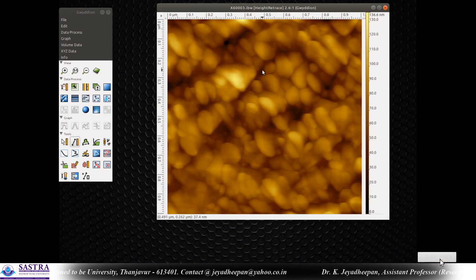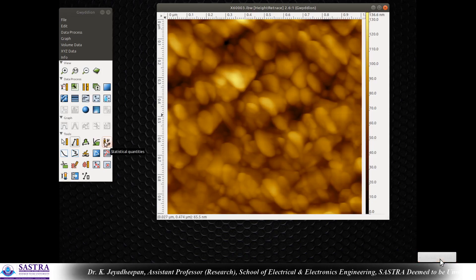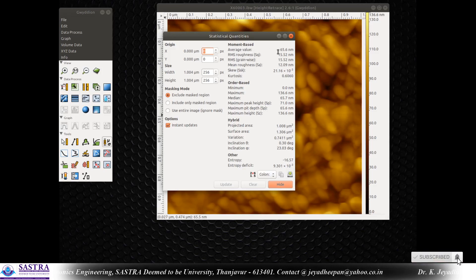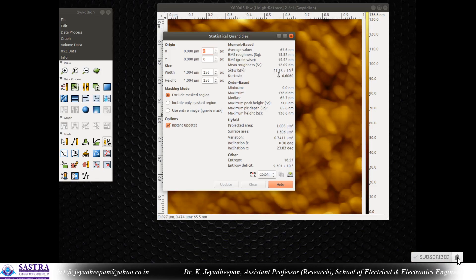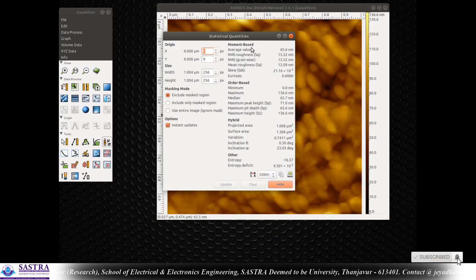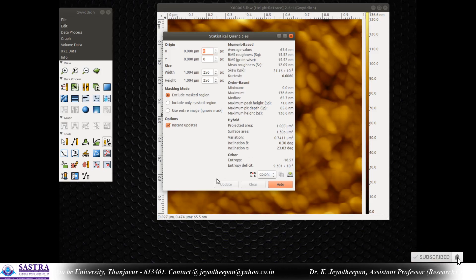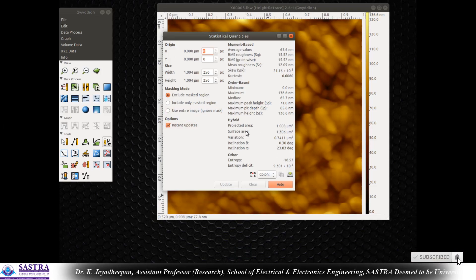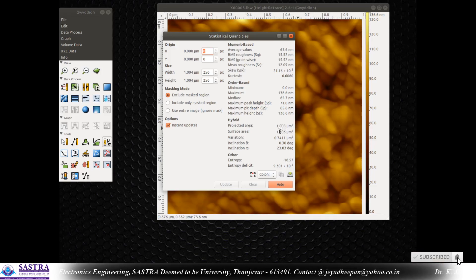If you want to extract statistical quantities from the AFM image, simply press 'statistical quantities.' Here you can see all the values: average value, RMS roughness, grain-wise roughness, mean roughness, skewness, and kurtosis. The projected data is one micron by one micron, but because of the nanostructures present on the surface, the actual surface area increases from one micrometer squared to 1.3 micrometer squared.